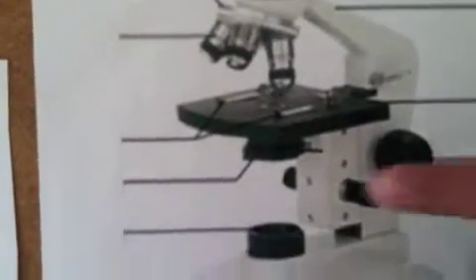Here is the diaphragm, which regulates the amount of light on the specimen from the light source. And the light source projects light upward through the diaphragm, through the specimen, and through the objective lenses.